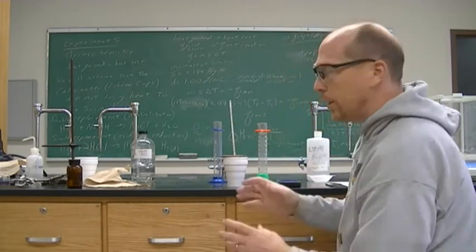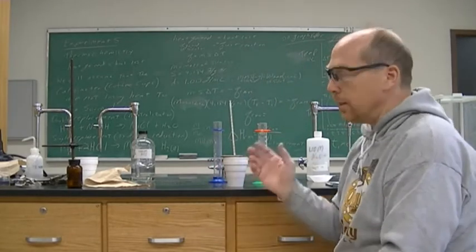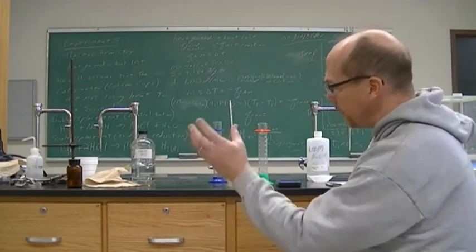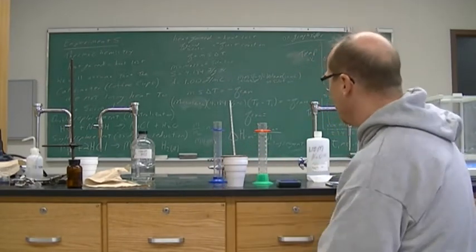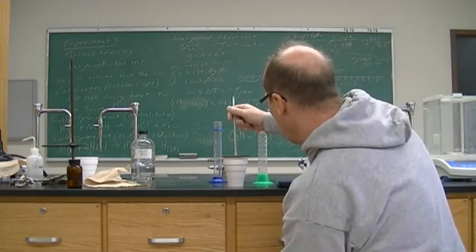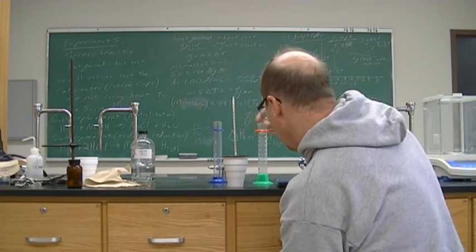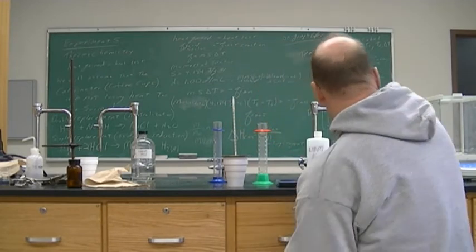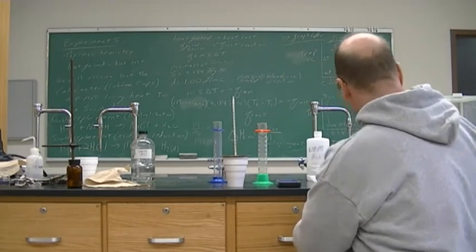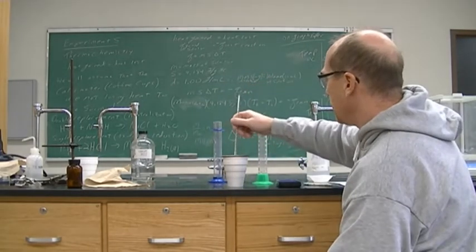Now, when you had the two liquids reacting, they're both liquids, and they mixed and they reacted immediately. This, you have a solid, and the solid is going to take a longer period of time to react, so the reaction is going to go longer and longer, and the temperature is going to keep rising until the reaction has completed. All right, and at the 4 minute mark, we are at 32.5 degrees Celsius. I still hear reacting.